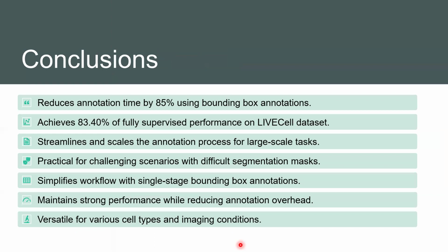So to conclude, our Cellboxify method reduced annotation time by 85% while achieving 83.4% of the fully supervised performance. We streamlined the annotation process, making it practical for large-scale tasks and challenging scenarios. And the method maintains strong performance across various cell types and imaging conditions, demonstrating its versatility.